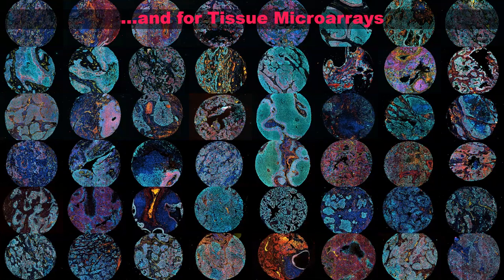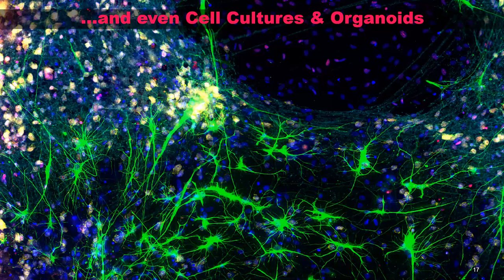You can also do tissue microarrays. What you see here are biopsies from lung tissue imaged on a CODEX experiment. In total, we did something like 54 cores in this experiment — it's just as easy to image tissue microarrays as it is to image a whole tissue. The only rule is you need to be able to fit them on your coverslip. Lastly, you can even image cell cultures and organoids. What you see here is a neuronal cell culture — cells grown directly on the coverslip, fixed, and labeled with antibodies. The cells did not wash off. We looked at this culture with 36 different antibodies, seeing glia, neurons, and connectivity between different parts of the culture that we had never really understood or even seen before.